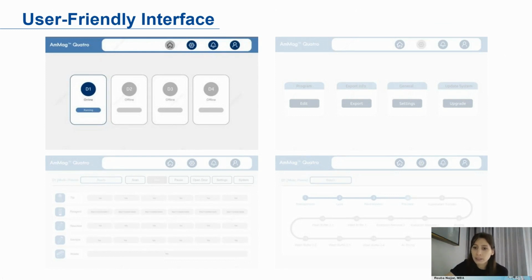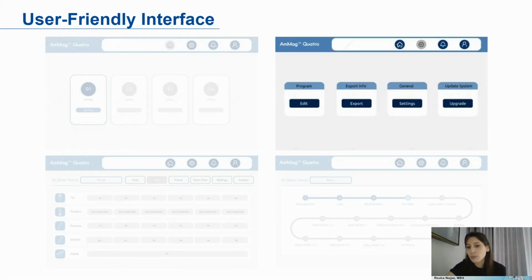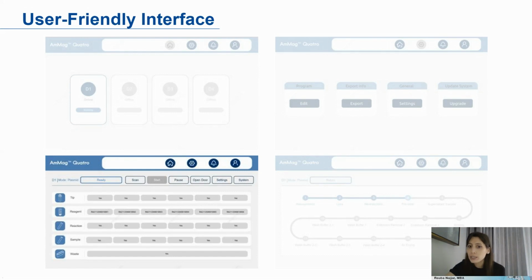So this particular slide, and I apologize, it's a little bit small, is to show you the user interface. As I mentioned before, the actual controller can control up to 4 modules. So the user doesn't necessarily need to have 4 modules plugged in. They can have 1 or up to 4. And what you're seeing in this particular example is that we have only 1 module plugged in, which is the blue line. And it gives you a wide variety of controls.